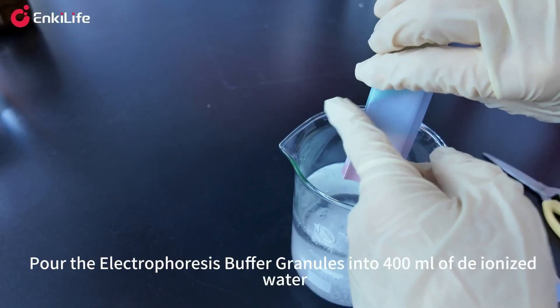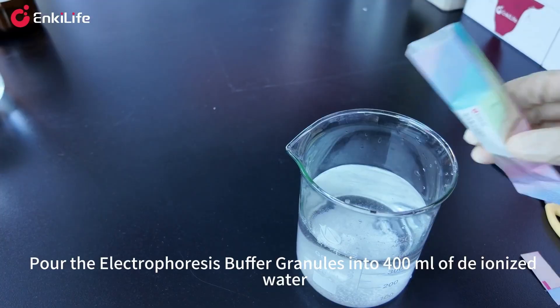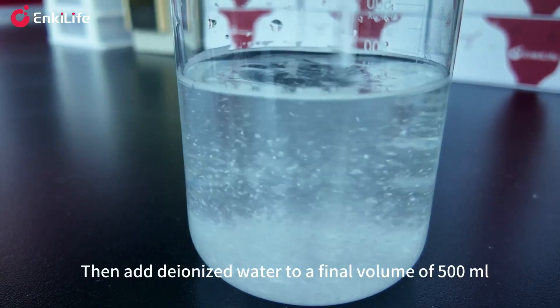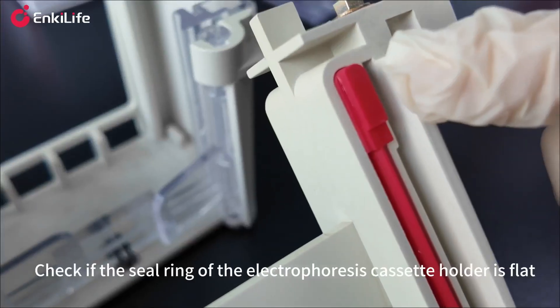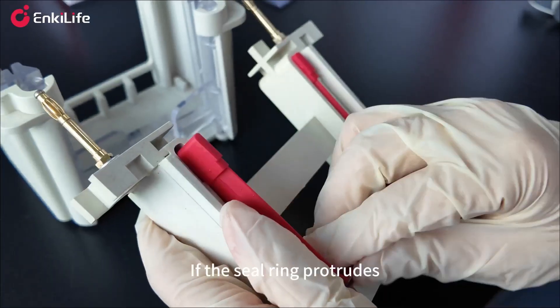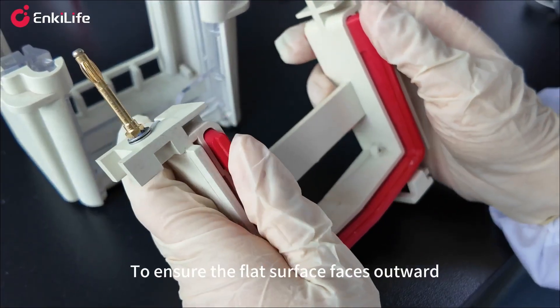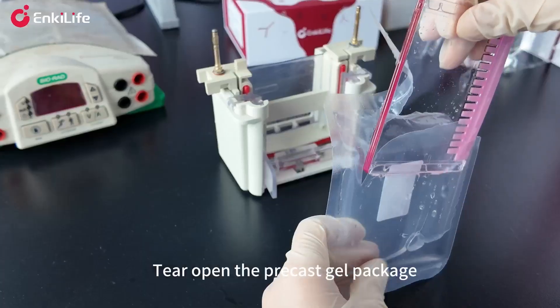Pour the electrophoresis buffer granules into 400 milliliters of deionized water, stir until dissolved, then add deionized water to a final volume of 500 milliliters. Check if the seal ring of the electrophoresis cassette holder is flat; if the seal ring protrudes, remove it and reinstall it reverse side out to ensure the flat surface faces outward.